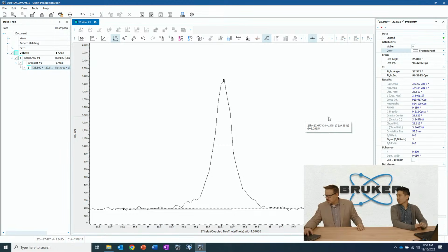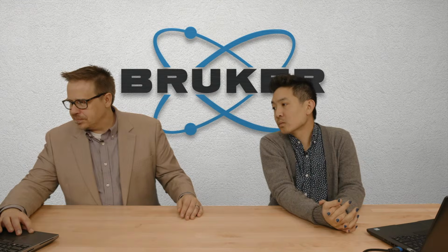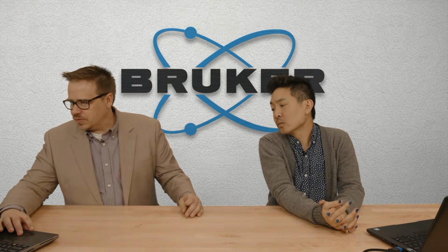So let's get to the next question here. With software like this, who needs scientists? I guess that's a comment. I know, that is a comment. That's a mood, you know? Yeah. Well, it's a good comment. It is a good comment, right?